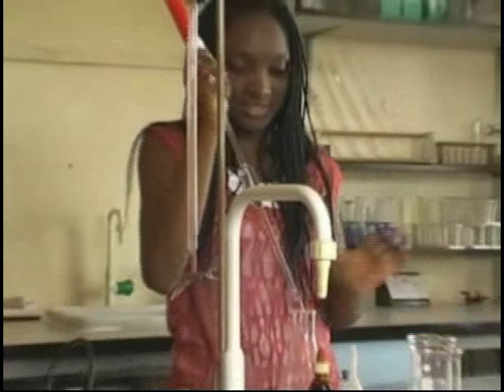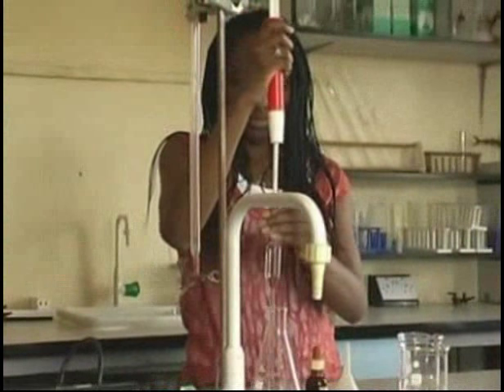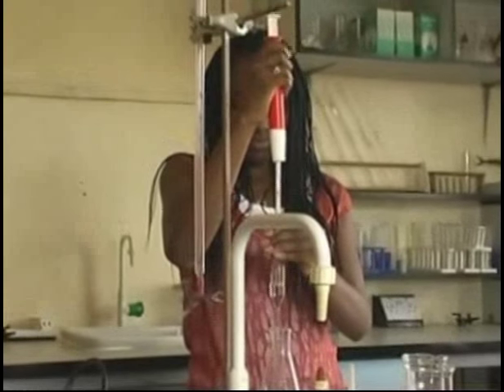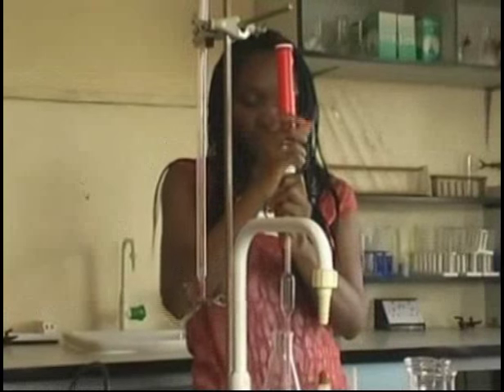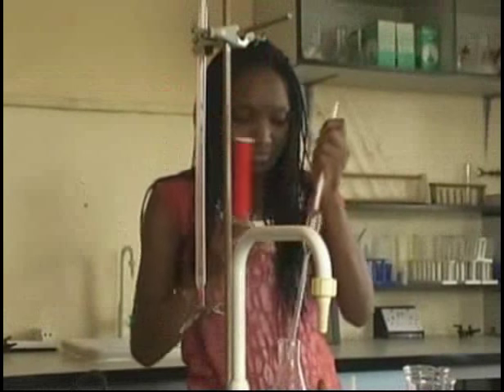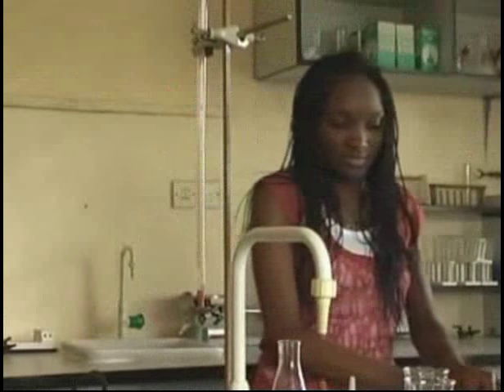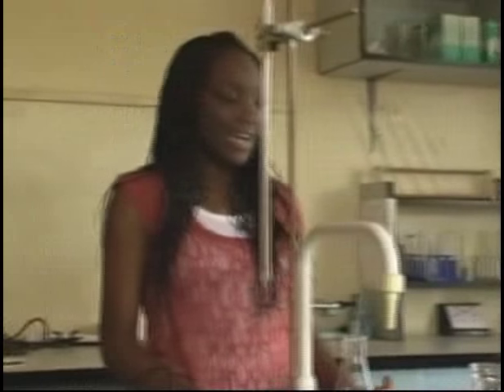Now that I have it, I'm going to put it into the conical flask. Next, I'm going to add acid into the burette until it's at the 0 mark.